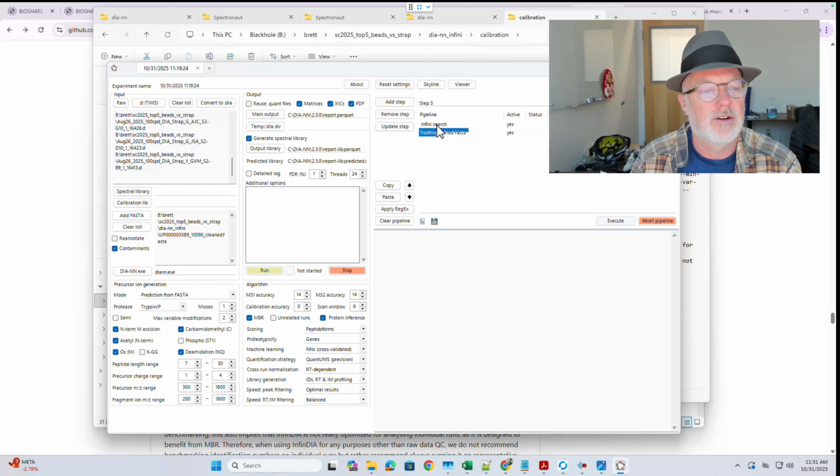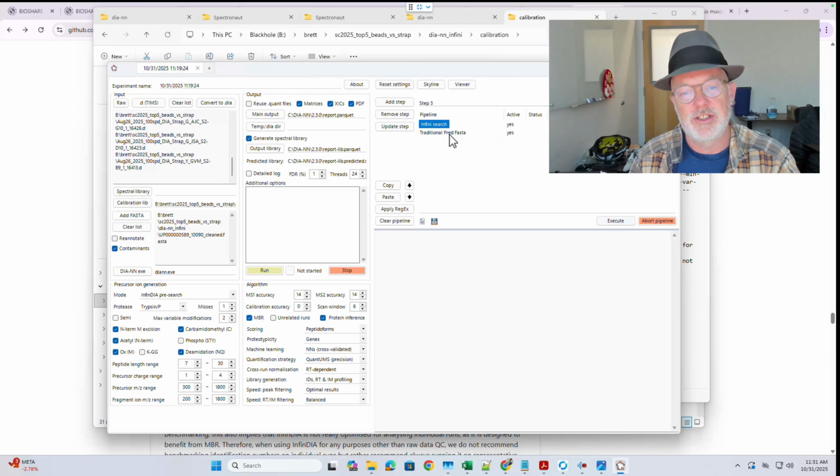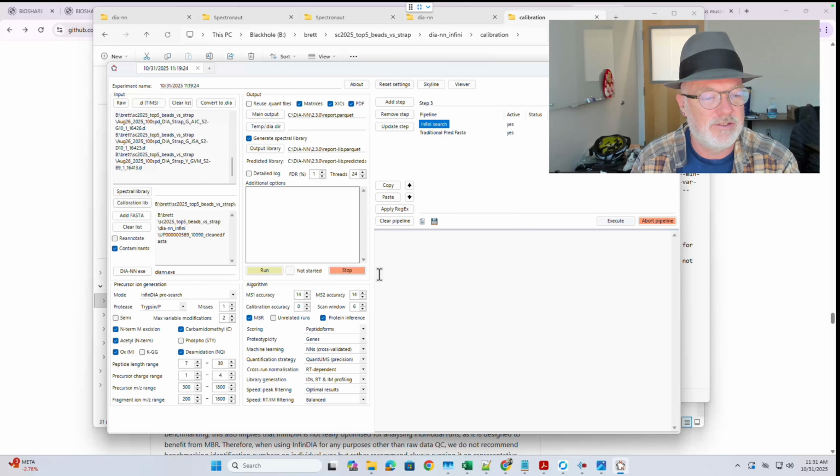And here, look, you can go back and I will update. I will add contaminants, and you just hit update. And now you have your 2 search settings. So these should search one after the other if you wanted to do both at once. I believe we did this. I did this correctly. Oh, nope.